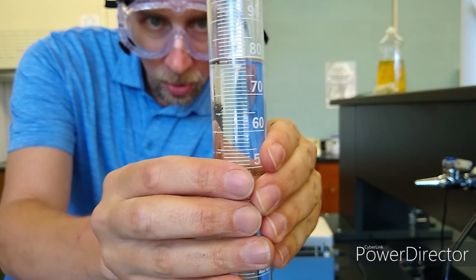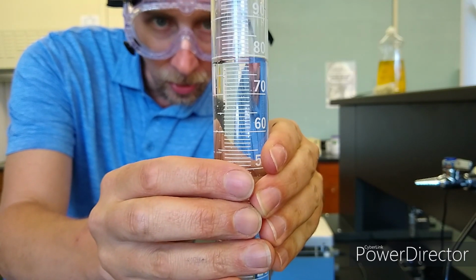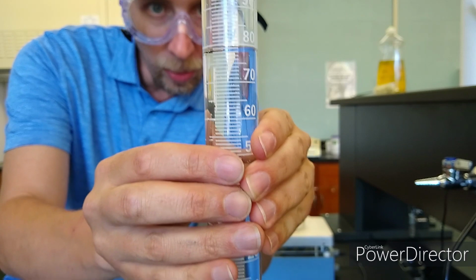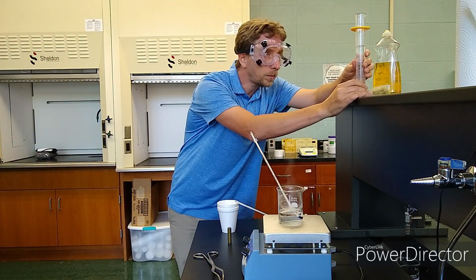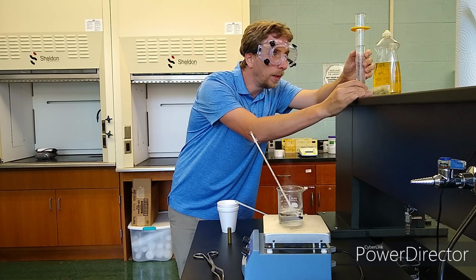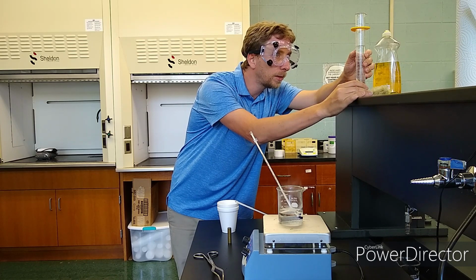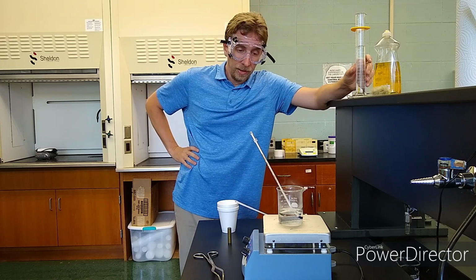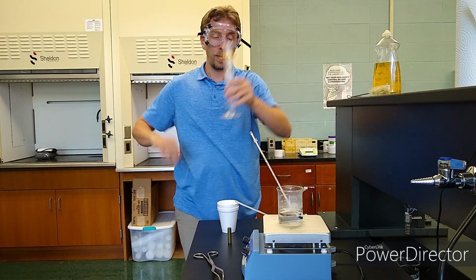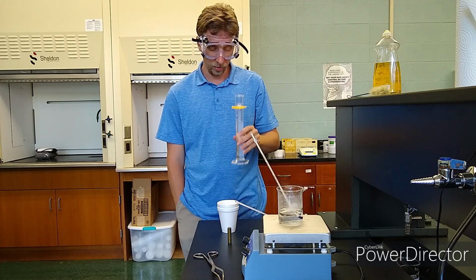Let's see. I try to hold it steady. It's kind of hard to hold it steady, but 79.8 is what I'm going to go with. Yeah, well, maybe a little bit less than that. Let's go with 79.6. So write it down on your paper. 79.6 is the volume of the water.